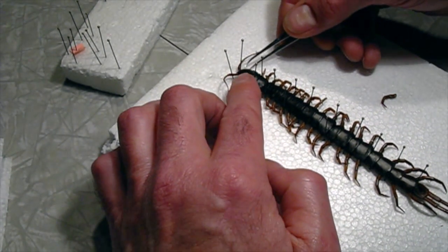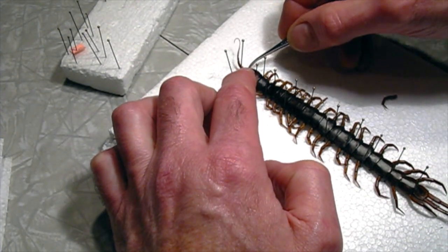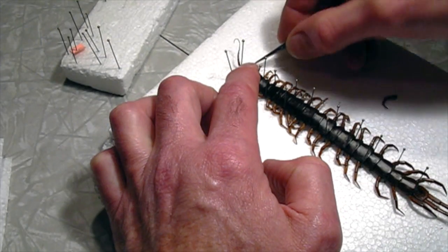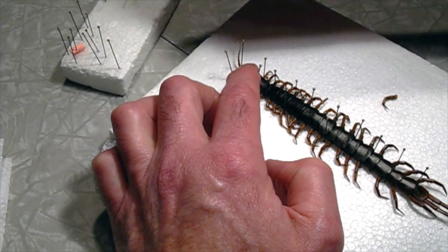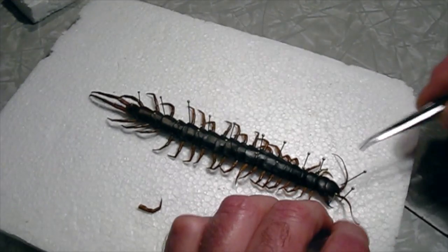Now I'm going to pull the jaws out. The jaws on a centipede are actually modified legs, and they're very sturdy, very sharp, venomous, really painful. I've never been bit by one, but I have talked to people who have, and they said it's excruciatingly painful.